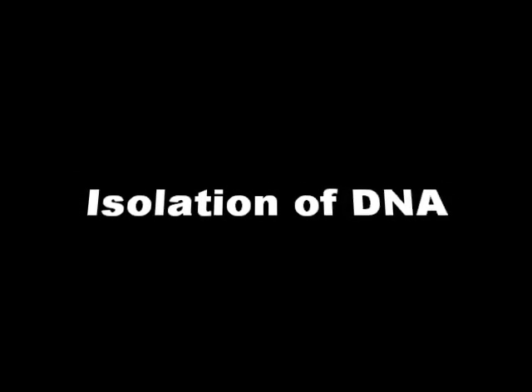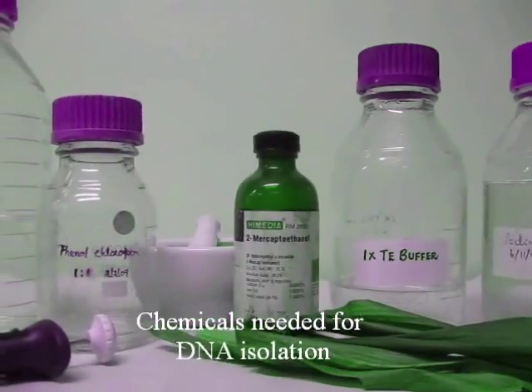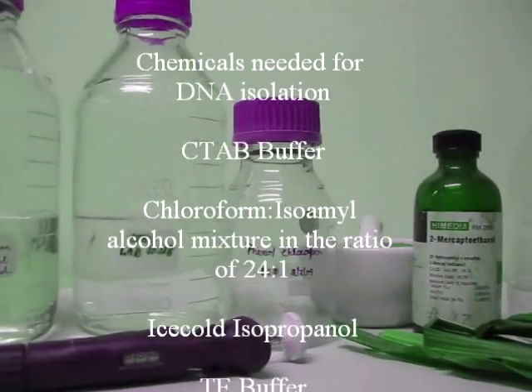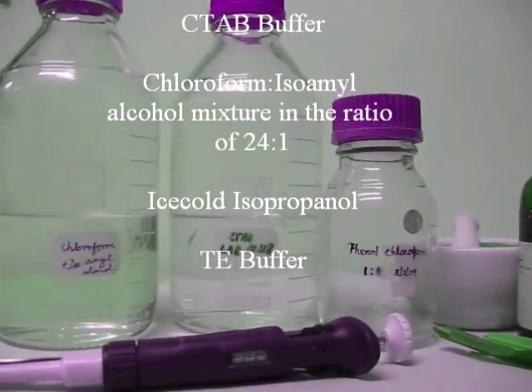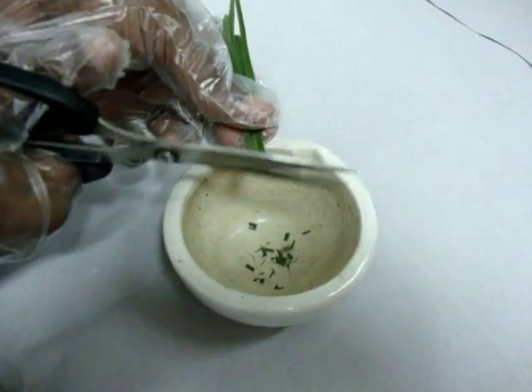After collection of samples, the DNA will be extracted using the CTAB method. The reagents required are CTAB buffer, chloroform isoamyl alcohol mixture in the ratio of 24:1, ice-cold isopropanol, and TE buffer.